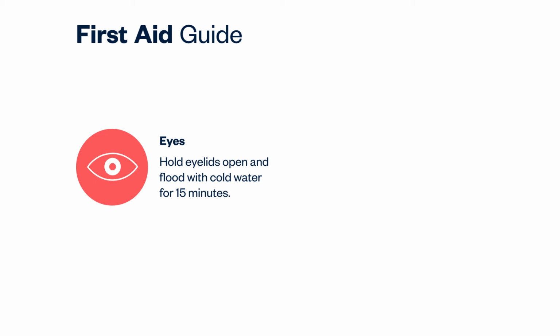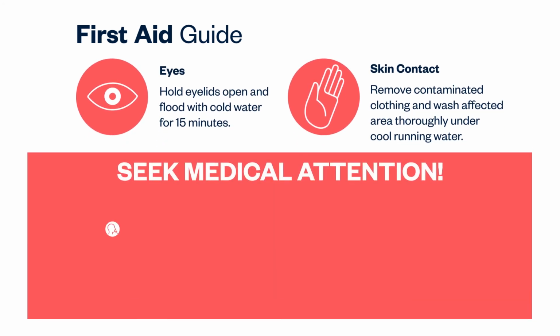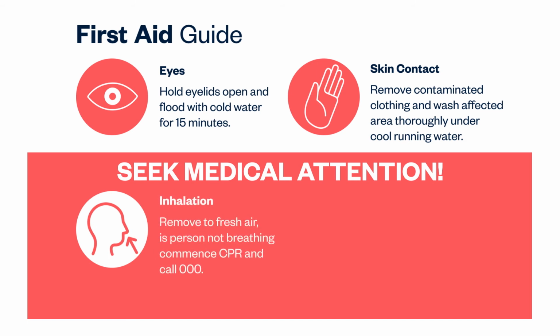If you get chemicals on your skin, remove contaminated clothing and flush skin with running water. If large areas of the body have been exposed, use a safety shower and flush the whole body for at least 10 minutes. If hazardous vapours or dusts are inhaled, immediately remove the victim from the area to fresh air and stay in a position comfortable for breathing. If breathing has stopped, immediately perform CPR until the ambulance arrives.